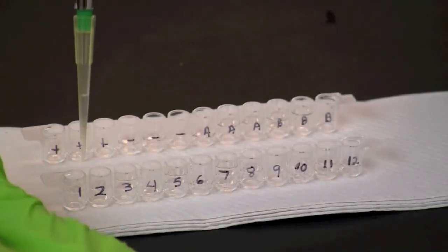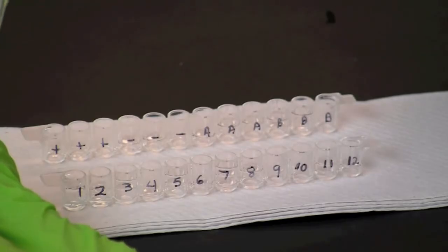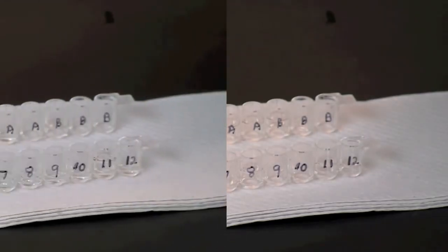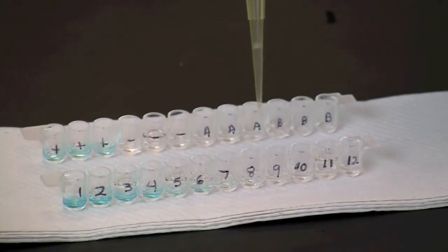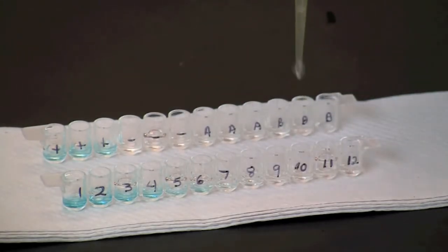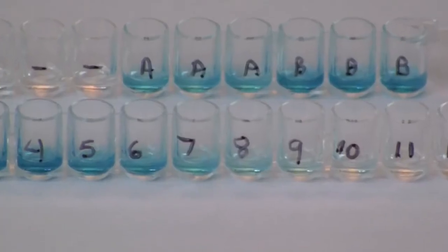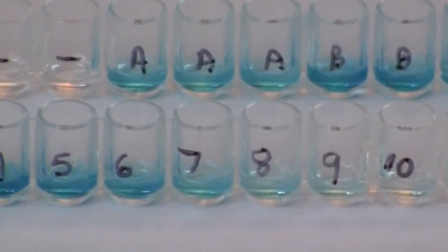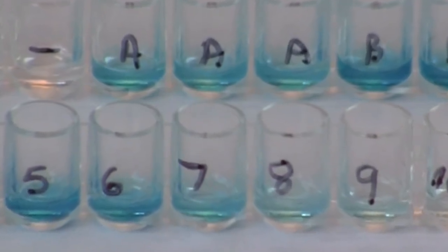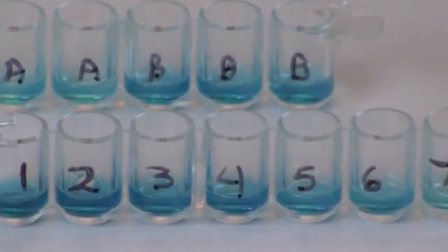Use a fresh pipette tip to transfer 50 microliters of enzyme substrate into each well of both microplate strips. Visually compare the intensity of the color in the test wells to the intensity of the color in the standards. Identify the standard that most closely matches the test wells and estimate the concentration of antigen in the test samples.